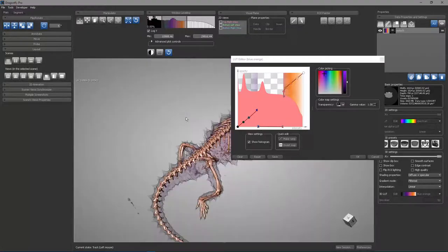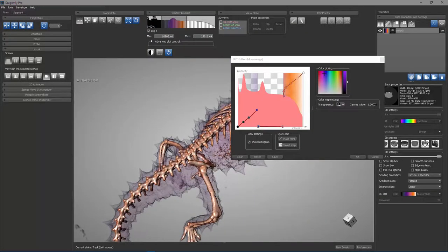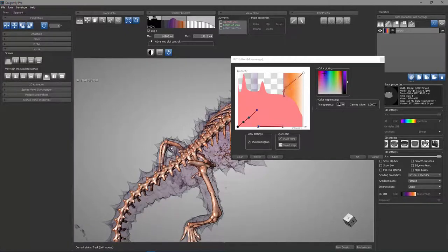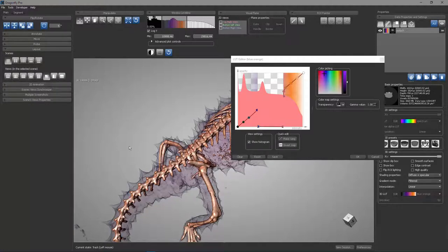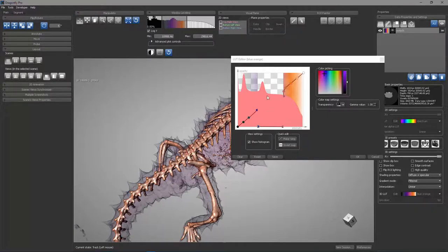And so now when I look in this window, I have a view where I have high opacity for my high intensities, which occupy the skeletal tissue, and the low intensities still have a little bit of opacity, and so when I go from very, very low intensity up through the beginning of the soft tissue, you can see this edge. And everything in here, which is mostly the soft tissue, is being rendered completely transparent.